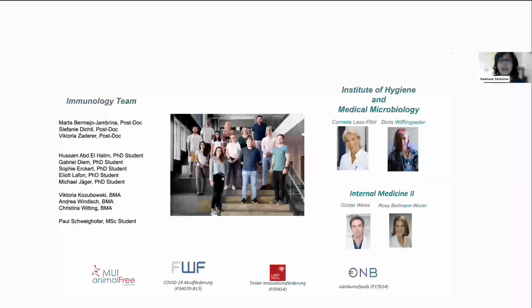Thank you, Doris. Another question, what kind of 3D cell culture model did you use for SARS-CoV-2 study? We used both models. On the one hand, we used the lung organoids and in particular the apical-out polarized organoids. But on the other hand, we also used the air-liquid interface model. So we always checked it within both models.